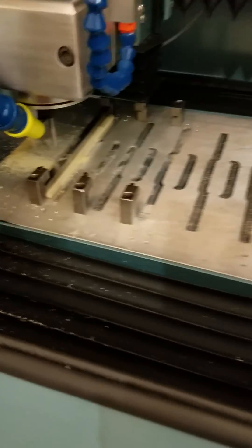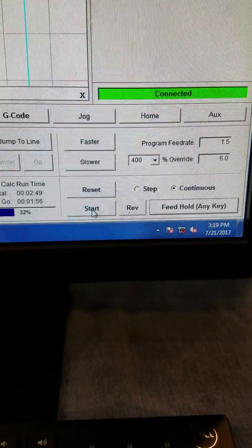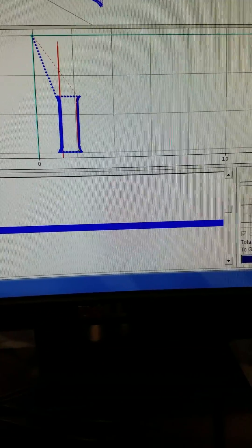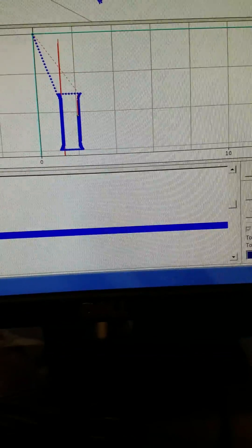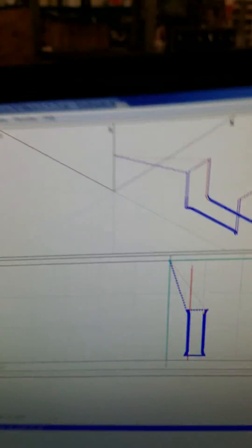Hit a key — hit a pause. And then to start it back up, come right back over here and hit start. The machine continues on, so it never loses its place. And as you can see, our timer is counting down.